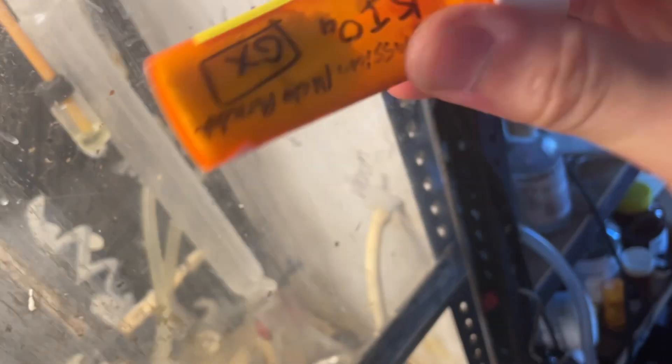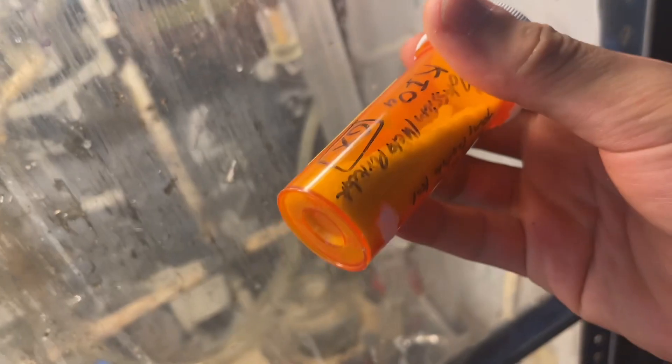There's our potassium metaperiodate. We might use this in a future video to make some metal complexes. This is an interesting compound — I don't think anyone has shown how to synthesize this on YouTube yet. So there you go.